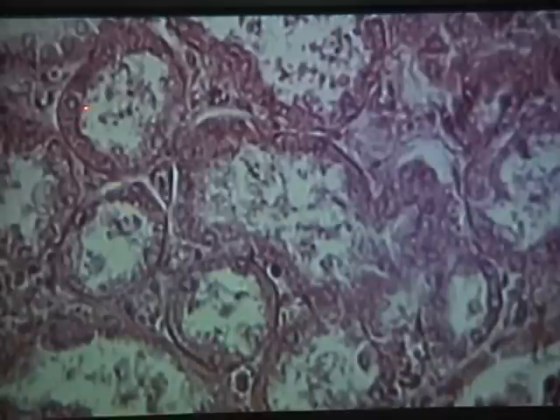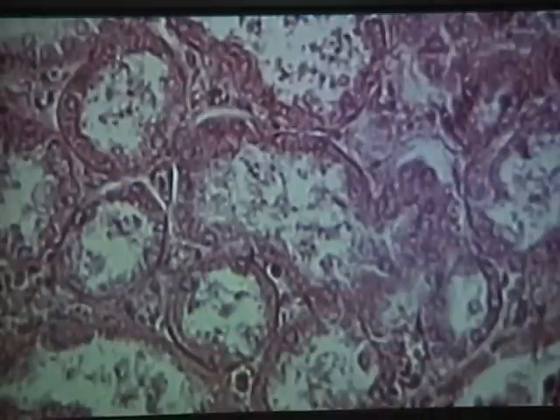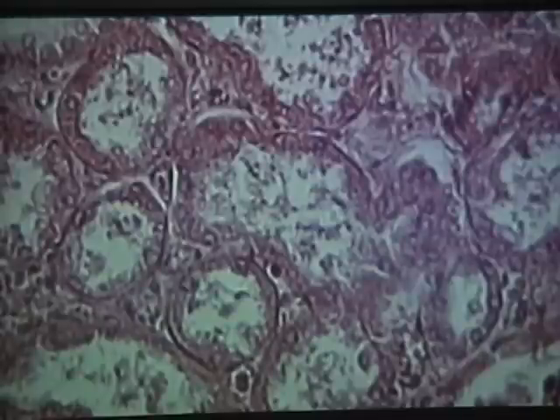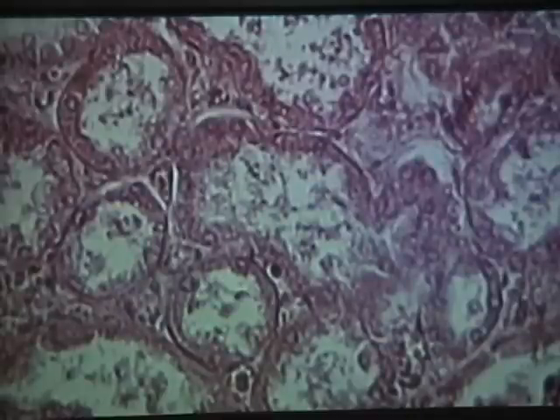And if you look right here, for example, you can see the cubed shape of the cells that form the kidney tubules, hence the name simple cuboidal epithelial tissue. So in the kidney, we have two sources of tissue that are very, very prominent: simple squamous epithelial tissue and simple cuboidal epithelial tissue. In the lab, we have another source of simple squamous epithelial tissue to look at, so let's go to that slide now.